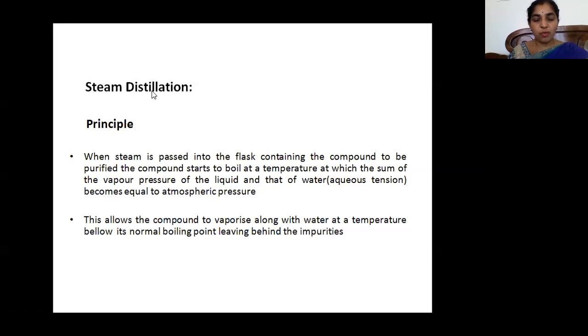Similarly, now let us pass on to steam distillation, one more method under distillation. Then what is the principle behind this method?